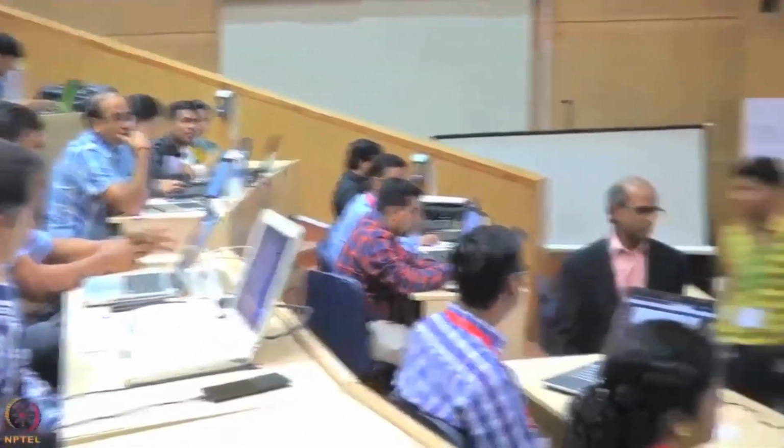So the question is, if you start fresh on a new project and you don't have any references, how do you do it? The way I've presented here, you create a reference for each big project. If you have a project where you have only 4 samples you're running in duplicate, that's a TMT 10-plex. You use 8 channels and maybe a couple of replicates and that's it. So you don't need a reference. But if you have a project where you have 100 samples, then you have to first get enough of those samples in, create your reference by combining equal amounts of multiple samples, and then start.